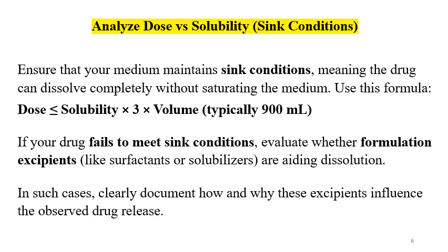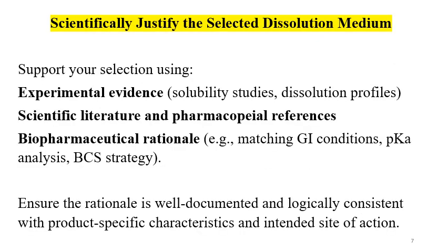Then another point: scientifically justify the selected dissolution media. We should support the medium pH through sound scientific rationale. We should show the experimental evidence for the solubility studies, dissolution profiles, dissolution in different media, multimedia dissolution. We should check the dissolution of RLD or reference formulation.